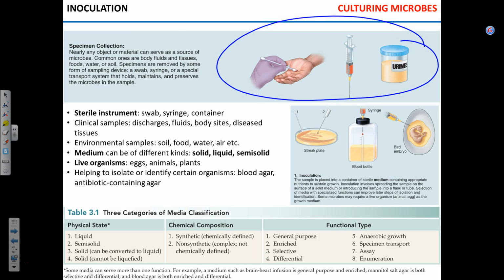You have to think about what you are collecting. One of the best examples: have you heard about the intestinal microbiome? Well, I bet you did, right? About 20 to 30% of your stool weight are microbial cells. So, feces, right? There are a lot of microbes in there. You can take the fecal sample, put it on the plate, and a lot of them will grow. Make sense? Feces. Is that intestinal microbiota? Not really.